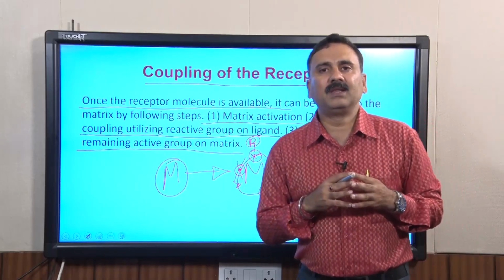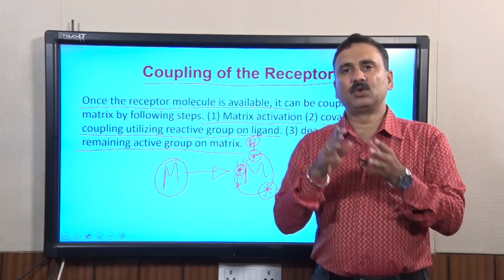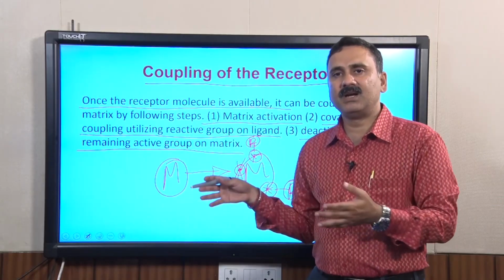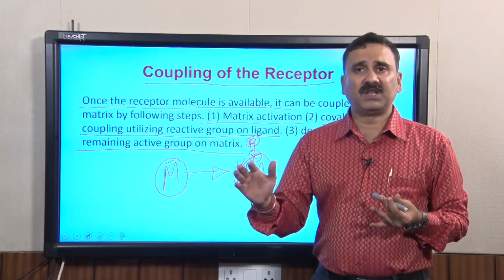In most cases, whether you have generated the receptor through recombinant DNA technology or through conventional chromatography, or you have generated antibodies, most of the time the receptors are proteinaceous in nature.